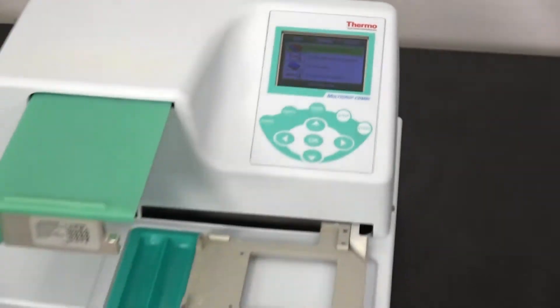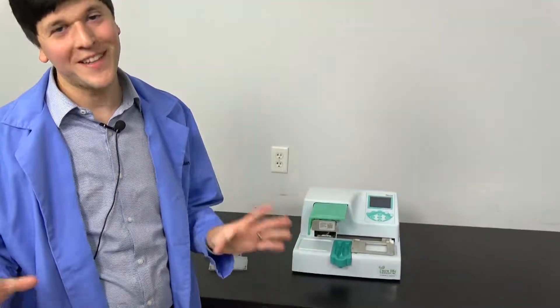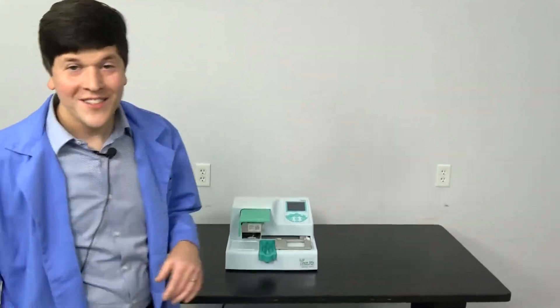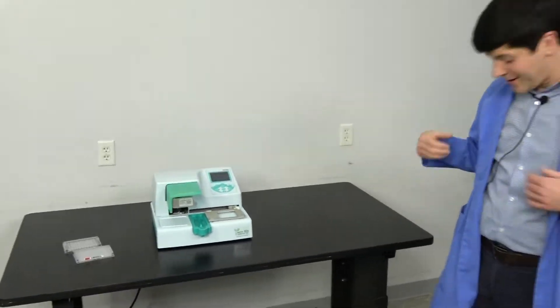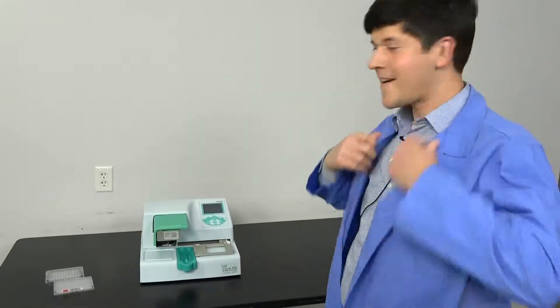I just had to start with the little dolphin startup screen because not every instrument gives you a cutesy little dolphin splashing out of the water. So today we're going to show you the Thermo Multi-Drop Kombi. By the way, I'm Nathan, borrowing our shop manager Steve's lab coat today so I look more official.